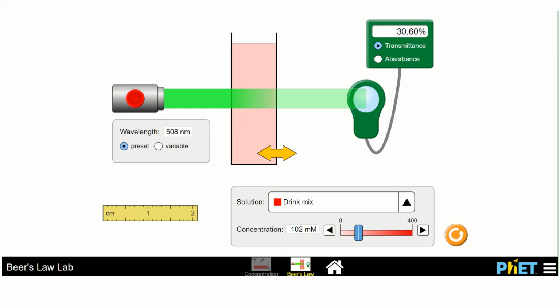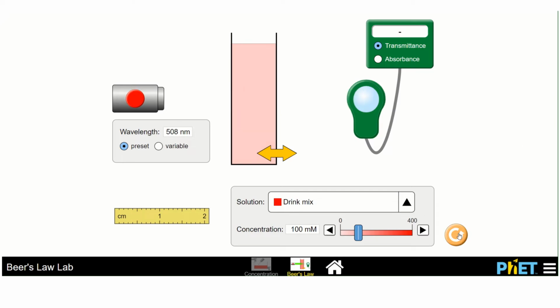Just understanding what is available here on the lab, I would say, is the most important thing. So take some time, as part 1, step 3 mentions and suggests, go ahead and click around for a while so that you know what's going on, you know what to click when you need to, and you know what's available to change, right? And also, if you want to just start over, just click this little circle arrow, and it'll reset everything for you. Okay, so don't be afraid to start over if you need to.